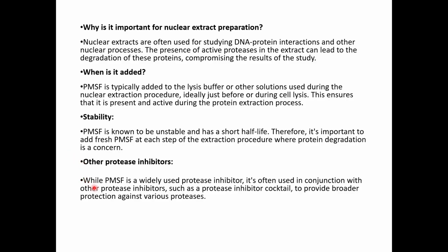Other protease inhibitors: while PMSF is widely used, it is also used in conjunction with other protease inhibitors such as a protease inhibitor cocktail. You have tablets which we use, which have many protease inhibitors mixed together, which provides broader protection against various proteases, because PMSF is specific to serine. So you might have proteases which are not serine proteases. In such cases, we use inhibitor cocktails.